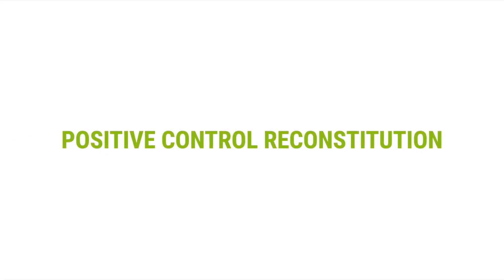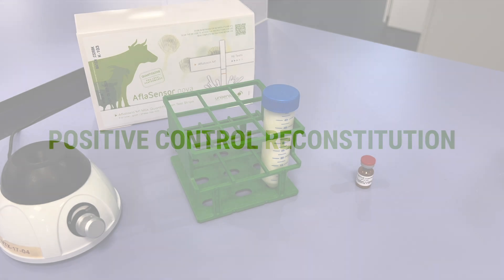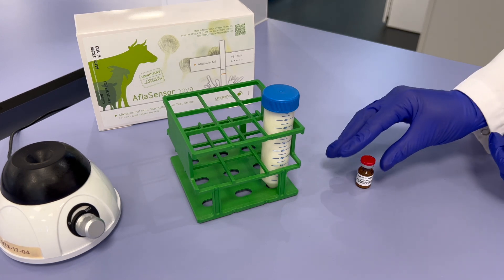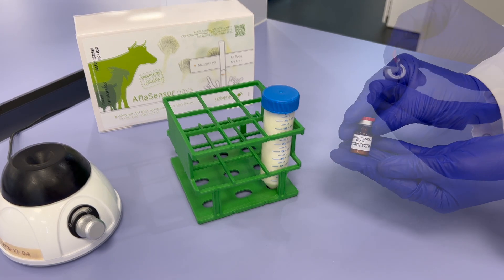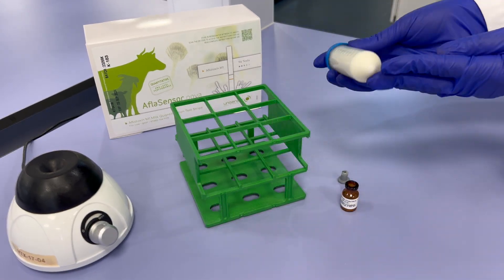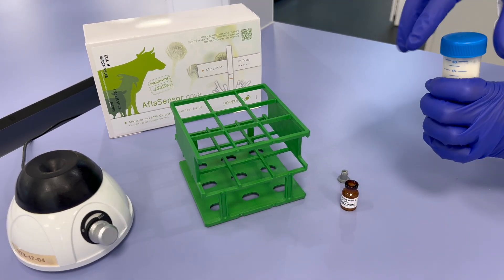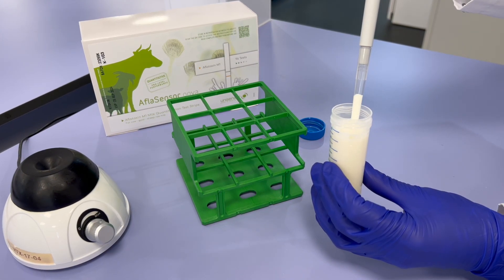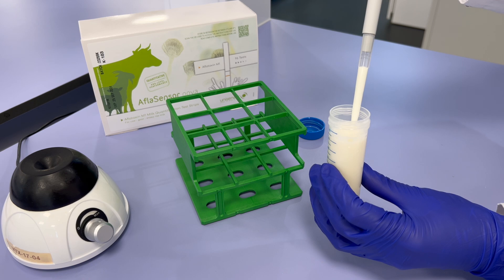Positive Control Reconstitution: Allow the positive control vial to stand at room temperature, 18 to 25 degrees Celsius, for 15 minutes. Confirm the negativity of aflatoxin-free raw milk by testing. The concentration must be strictly between 0 PPT and 5 PPT or not an available number. Add 1 milliliter of aflatoxin-free raw milk to the positive control vial.